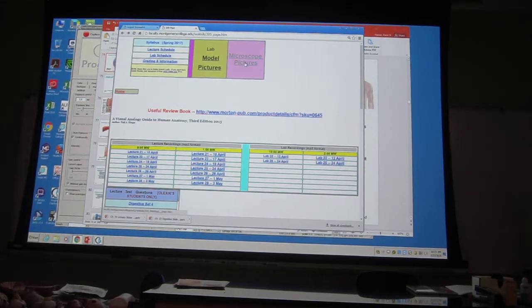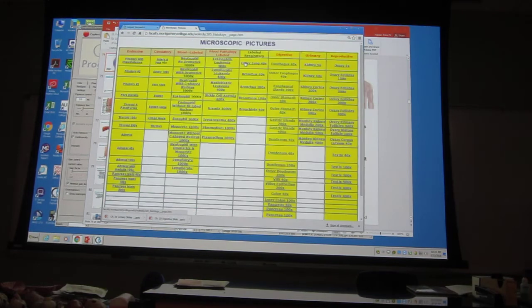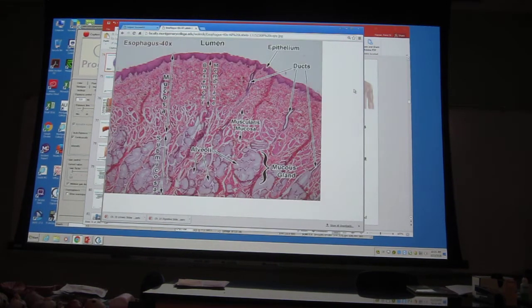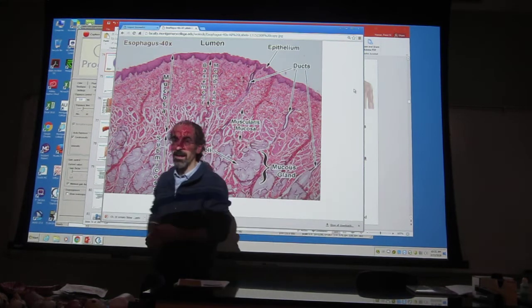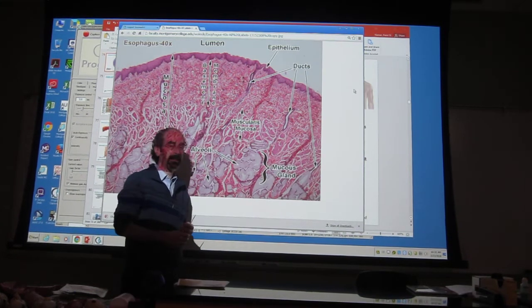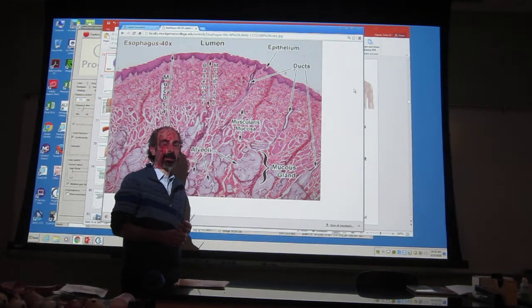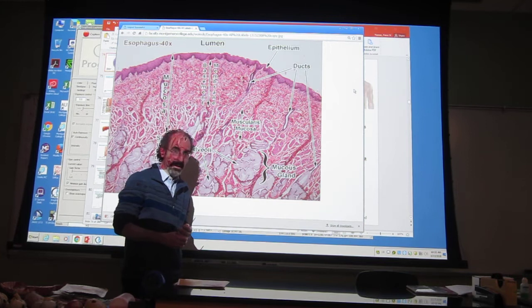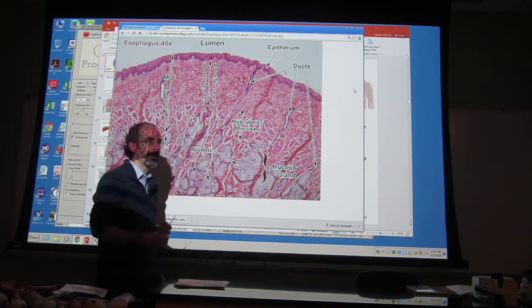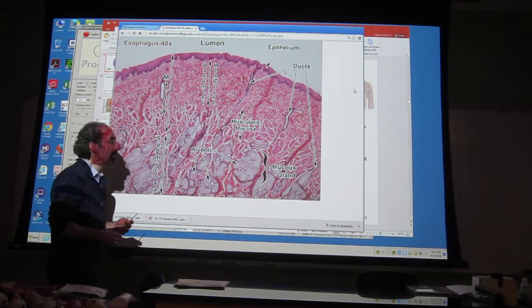Next, what I'd like to do is go to Professor Alexis's website just to give you an overview, because he takes some wonderful photos of your slides. I want to just give a shout out to Professor Alexic for having the foresight to do this. Slides like these, I think, really help the students and help me too to review during times when students don't have access to the microscopes in the lab. Thank you, Professor Alexic, for thinking to do this and for putting this up for us and taking the time out to make this many years ago.